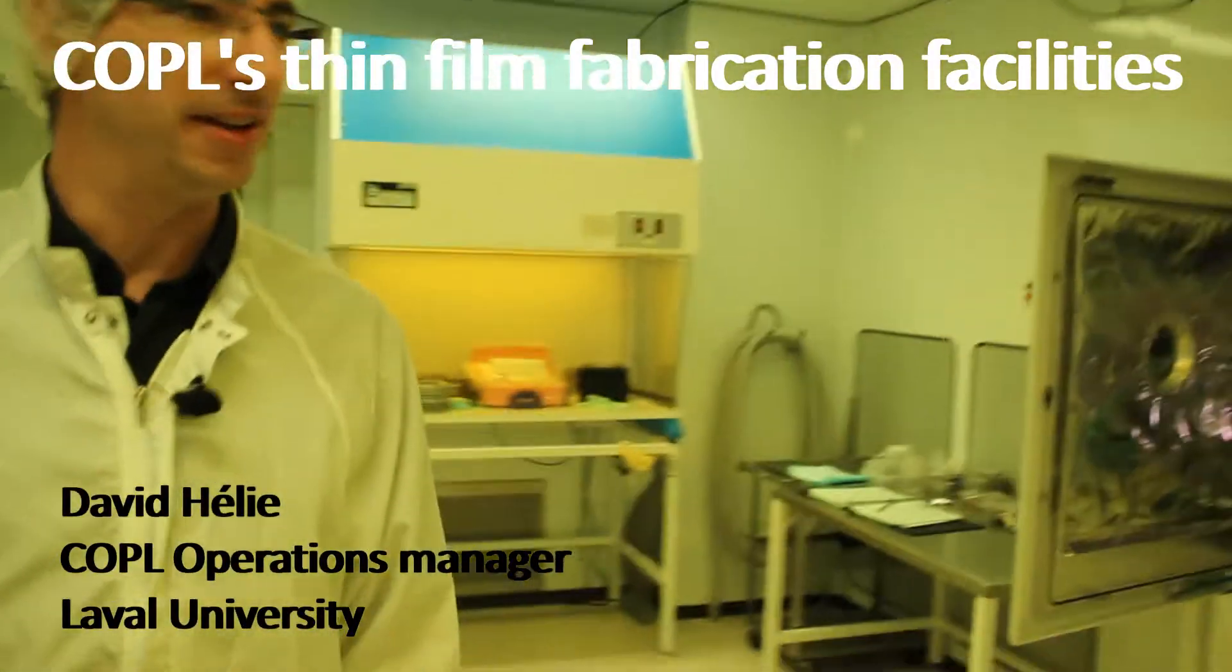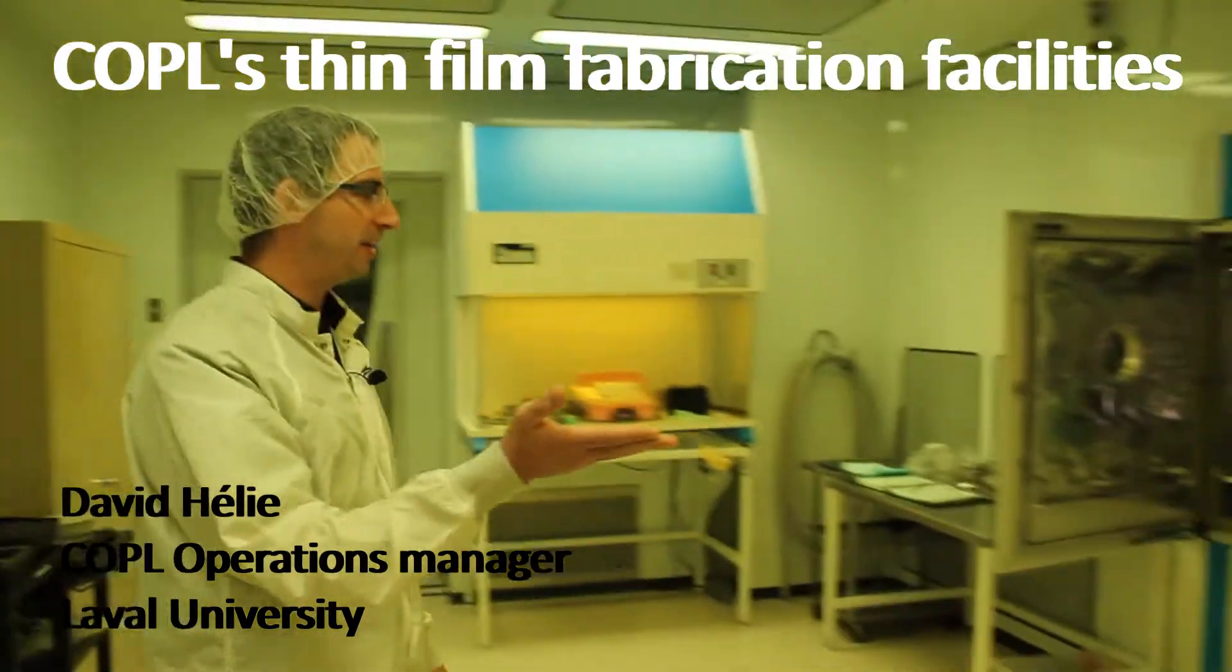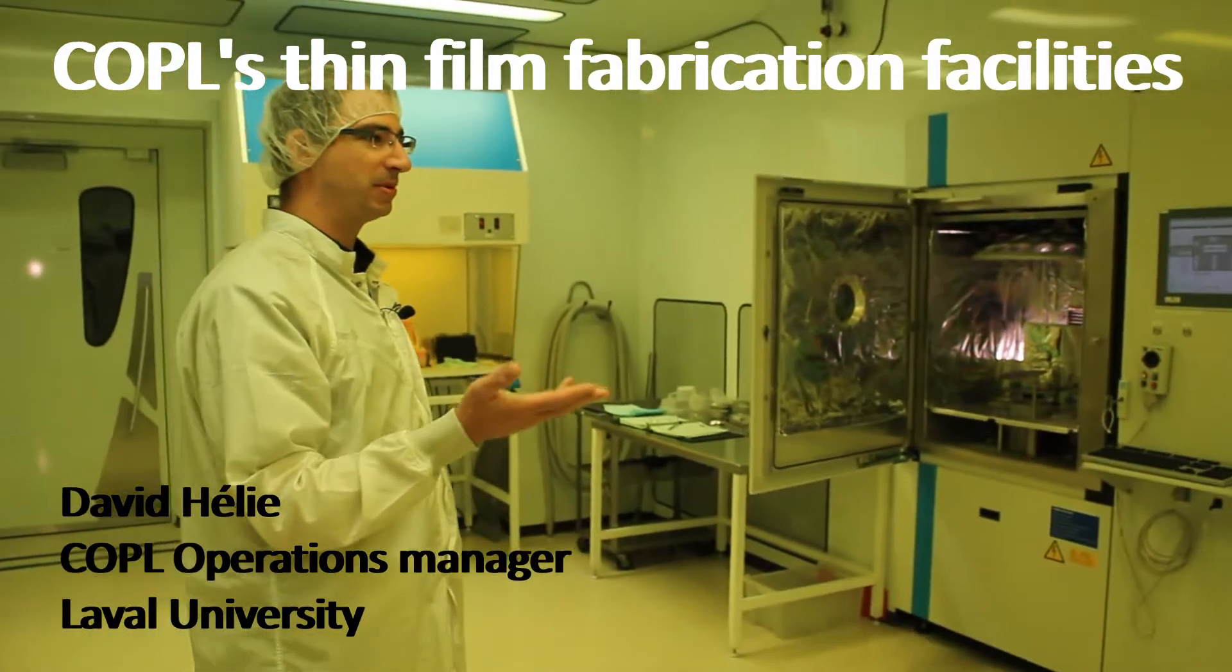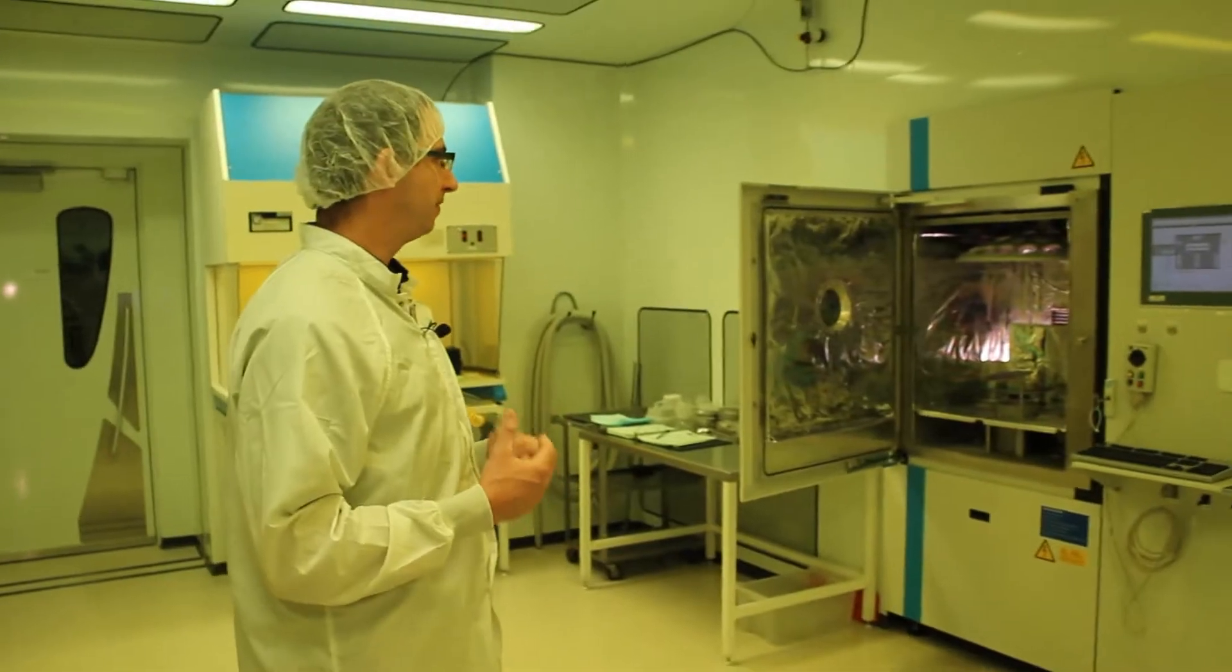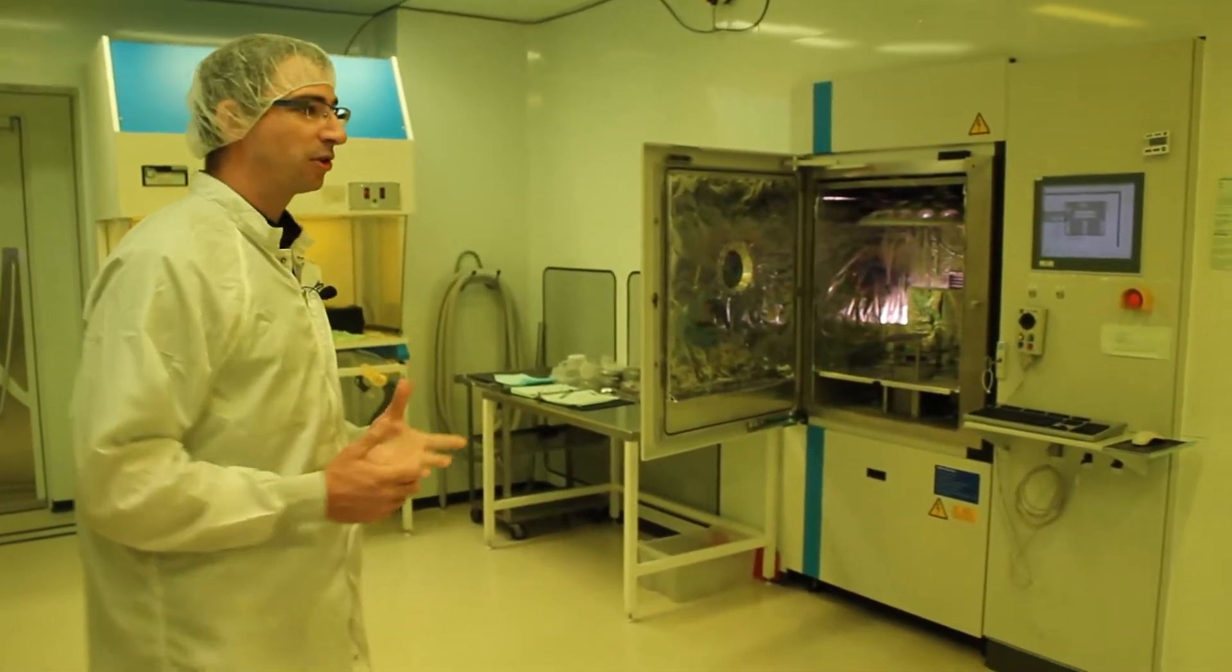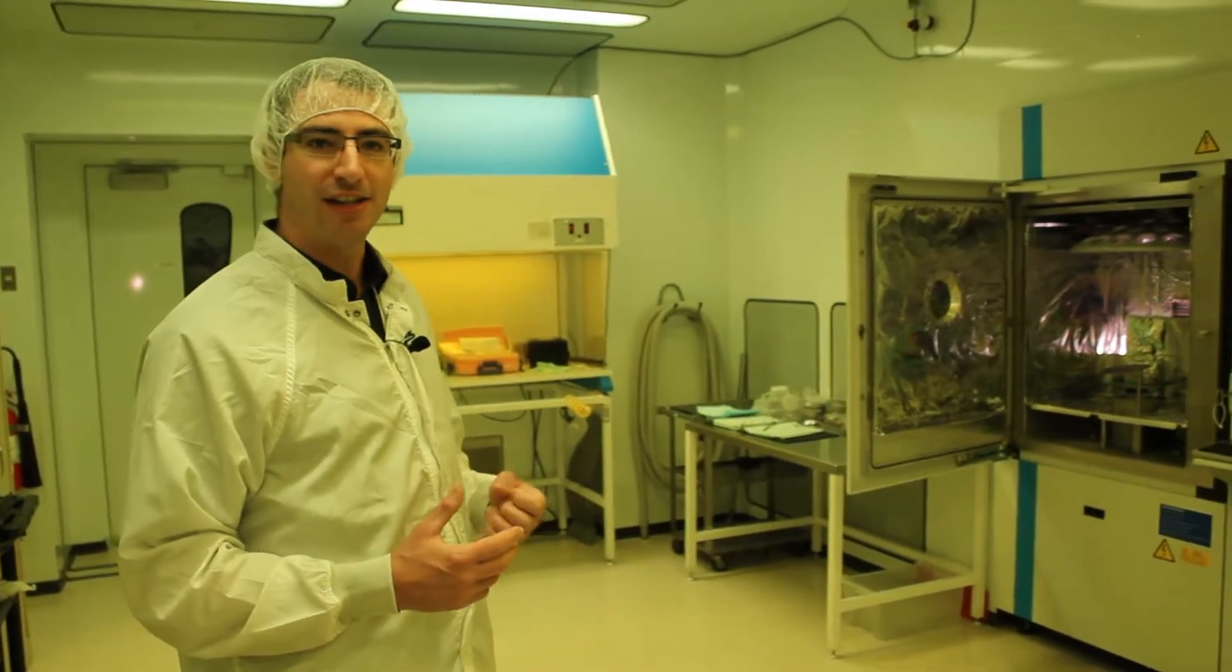Welcome to the Thin Film Fabrication Lab. The two systems we have in front of us are the two principal systems that we use to support our internal research needs for thin film fabrication. They are both commercial systems and they are very complementary in their technologies.